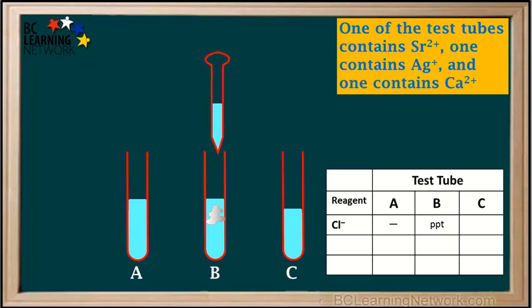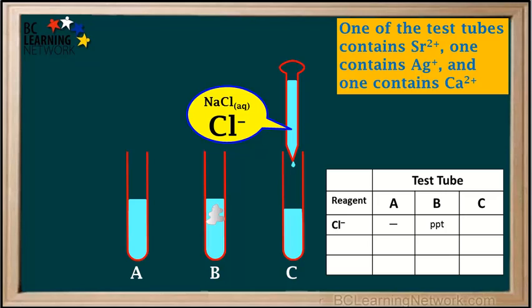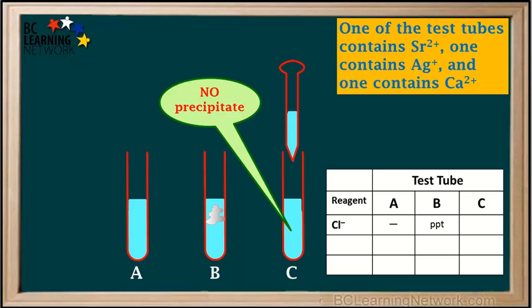We'll take the pipette out of test tube B, refill it, and bring it over to test tube C. We'll add the chloride solution to test tube C. This time we didn't form any precipitate, so we'll write a dash in the table for chloride in test tube C.